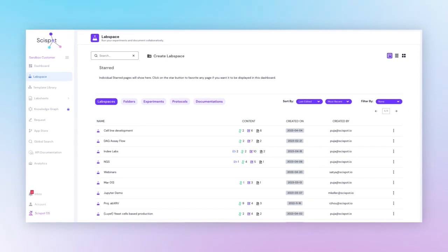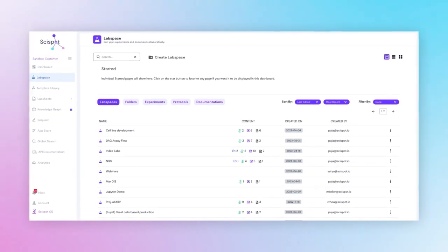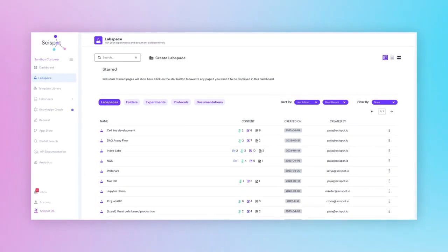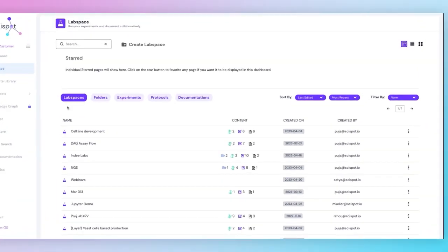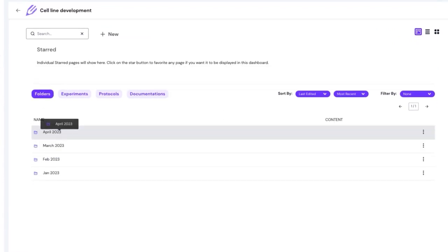There are many more to explore. Let's check the basic structure for now. If we go into this Labspace, we can take a closer look at Cell Line Development.